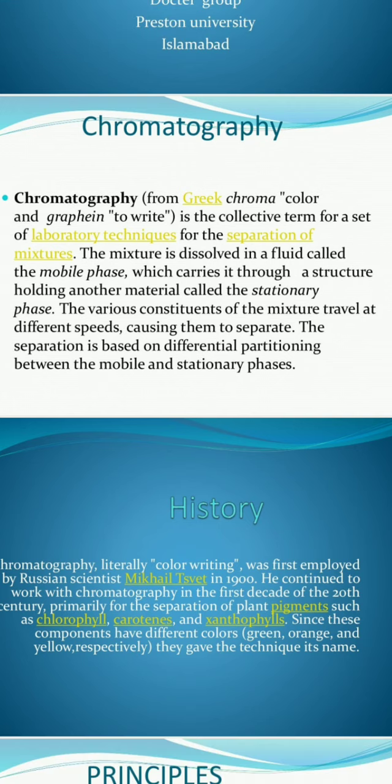Basically, the various constituents of a mixture travel at different speeds, causing them to separate. This is the basic principle of chromatography, in which the substances present in a sample are separated on the basis of differential partition between the mobile phase and the stationary phase.